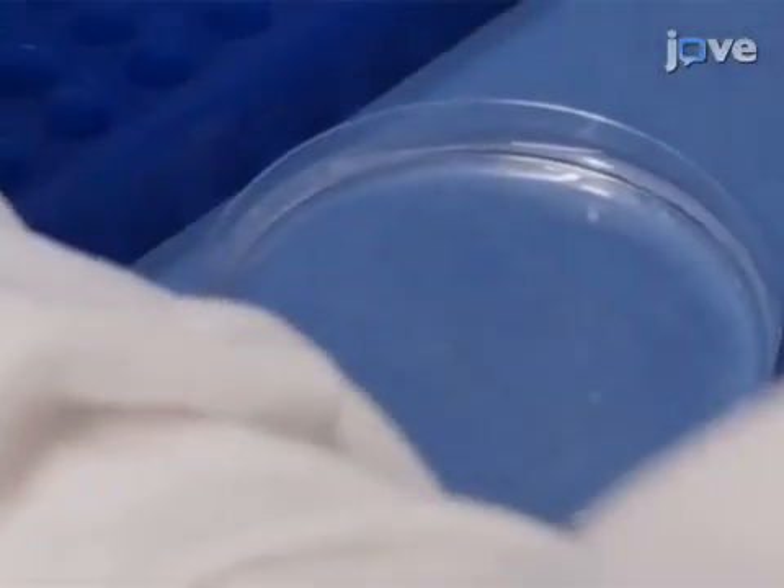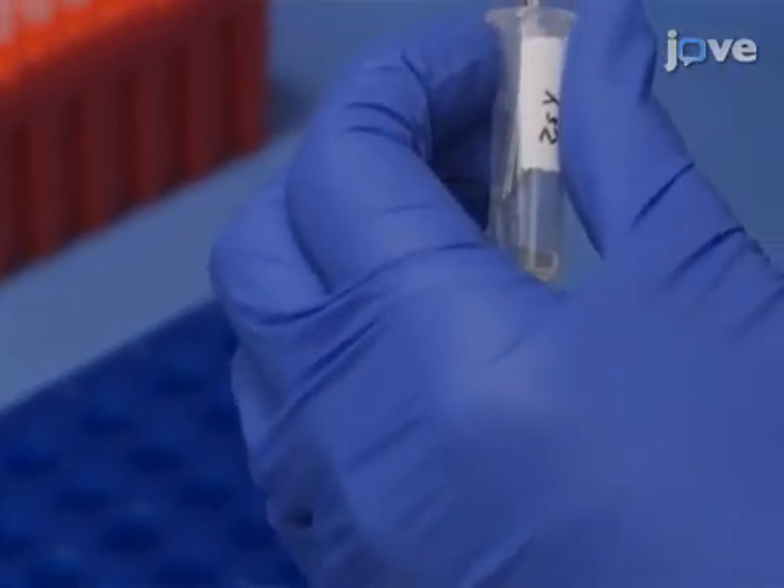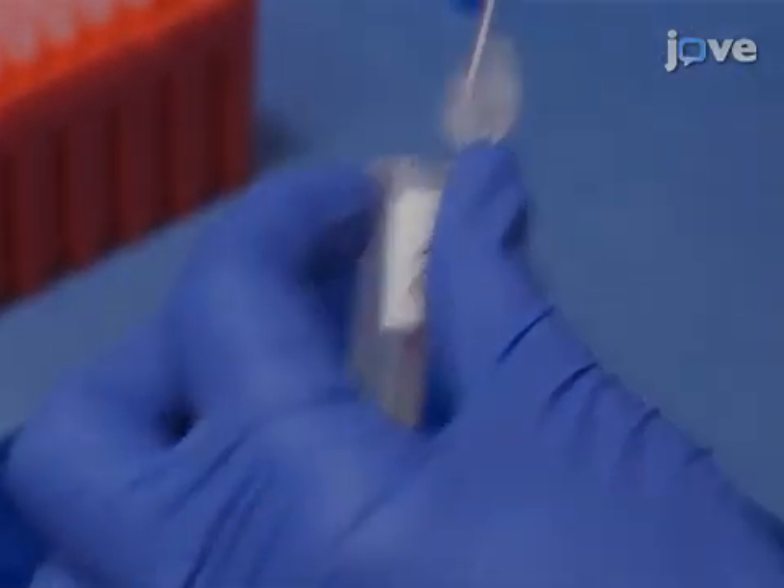Next, use a wide bore glass pipette to transfer the embryos into a two milliliter microcentrifuge tube in a minimum volume of egg water.